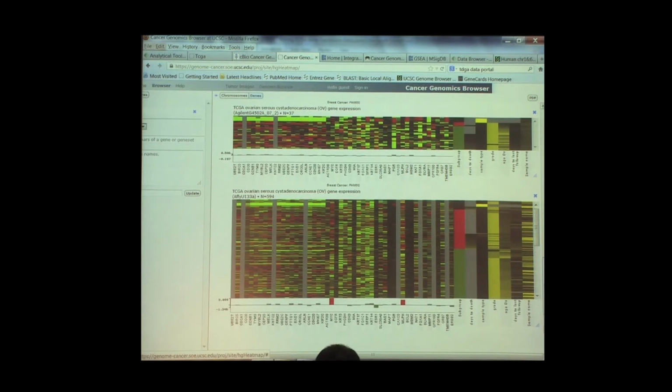Yeah. So I have everything displayed. I picked the gene set that you're talking about, the IGF-1 pathway mapping. Yeah, so get rid of IGF-1, click. Okay, I can get rid of that. And then what's the question? So the question after you've got the statistics up and running is, are you seeing the same thing out of all the data sets? And if not, why not?